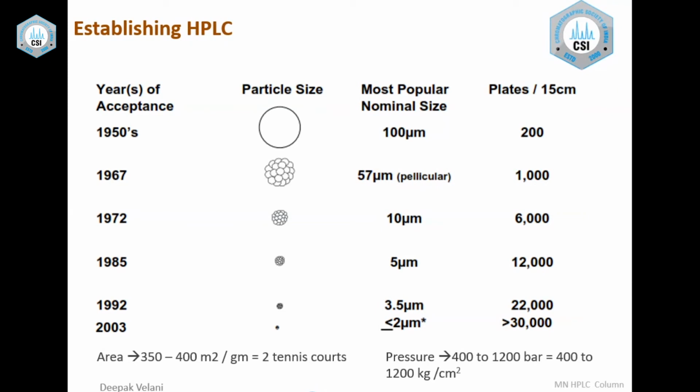Just as an example, when a bullet hits a target, it's around 77 kg per centimeter square pressure, which kills a person. 77 to 100, that's what I could refer to. So if it is 400 bar, it is almost 4 times the pressure of a bullet killing a person. So you can understand what kind of pressure it is.